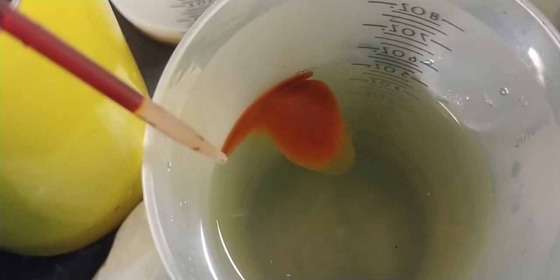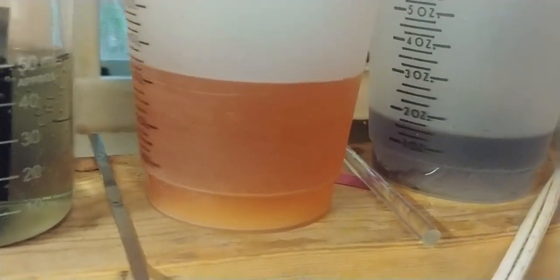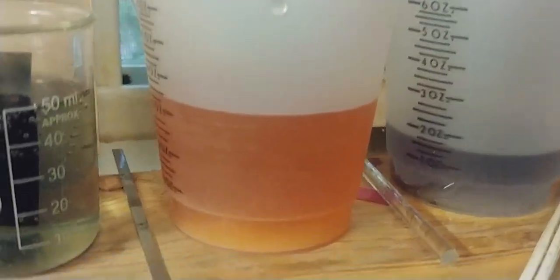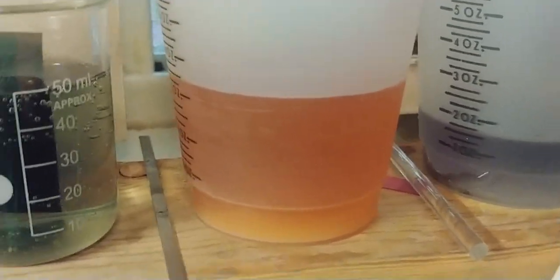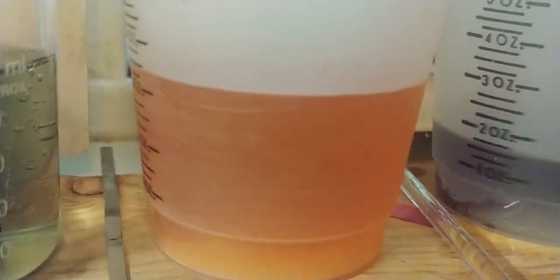My first test for thallium just made the solution orange with a white precipitate. I used bismuth nitrate, nitric acid, potassium iodide, and a source of soluble thallium. I would say that's a negative, but I'm not sure about this one.